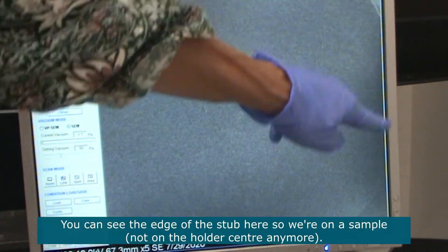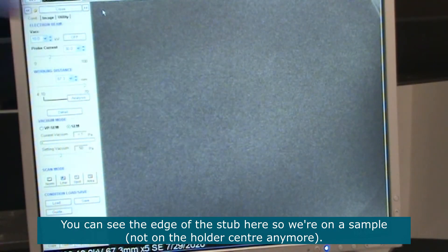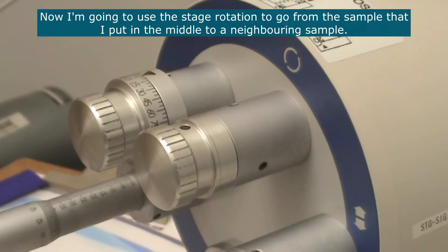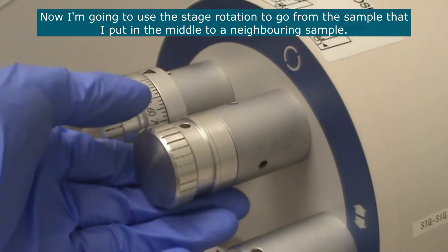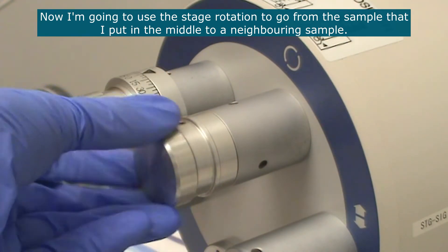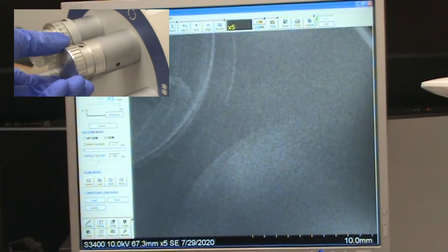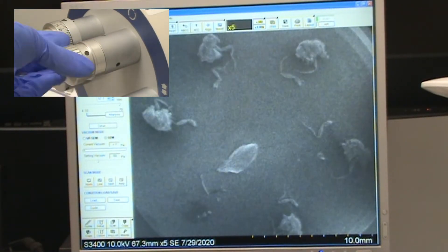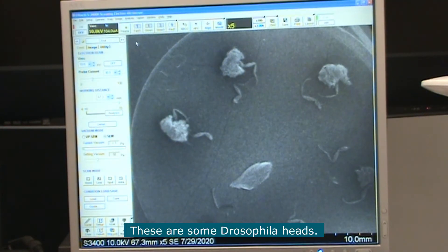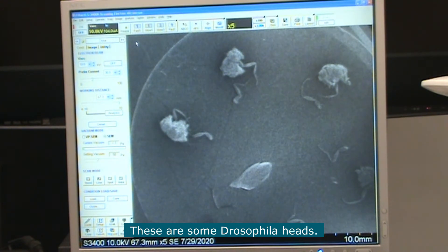You can see the edge of the stub here, so this is one of the stubs that has a sample. I'm going to use the stage rotation wheel to move from the sample in the middle to a neighboring sample. These are some Drosophila heads. I'll place one of the heads in the middle and then put it into focus.